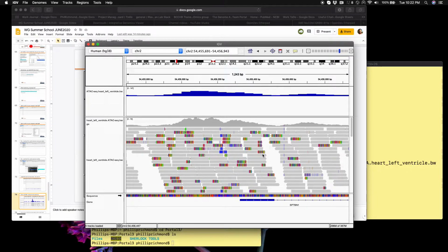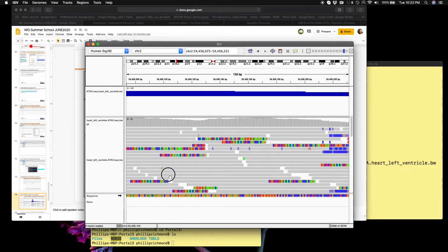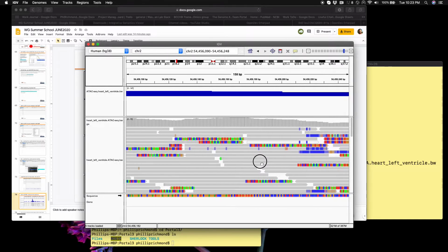You notice that these boxes have a directionality to them. You may also notice that several of them seem to have these colors on the individual reads. And this is because these reads likely have some adapter sequence, which we decided not to trim out from our dataset beforehand, although it seems that our reads are still able to align uniquely against the genome.